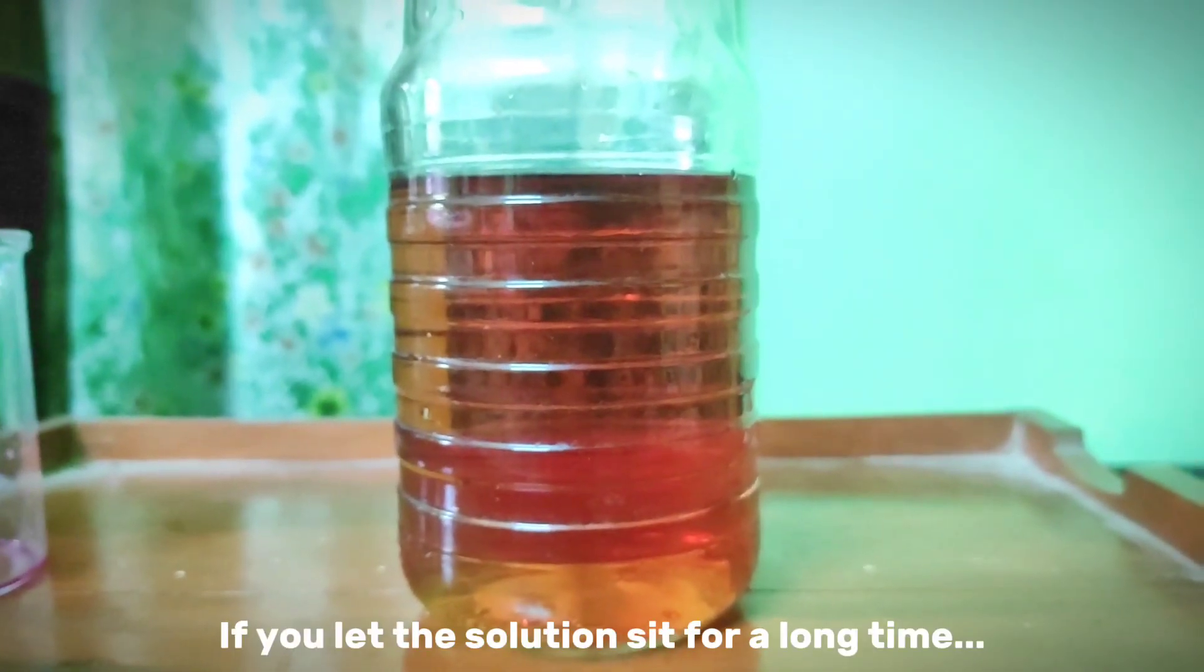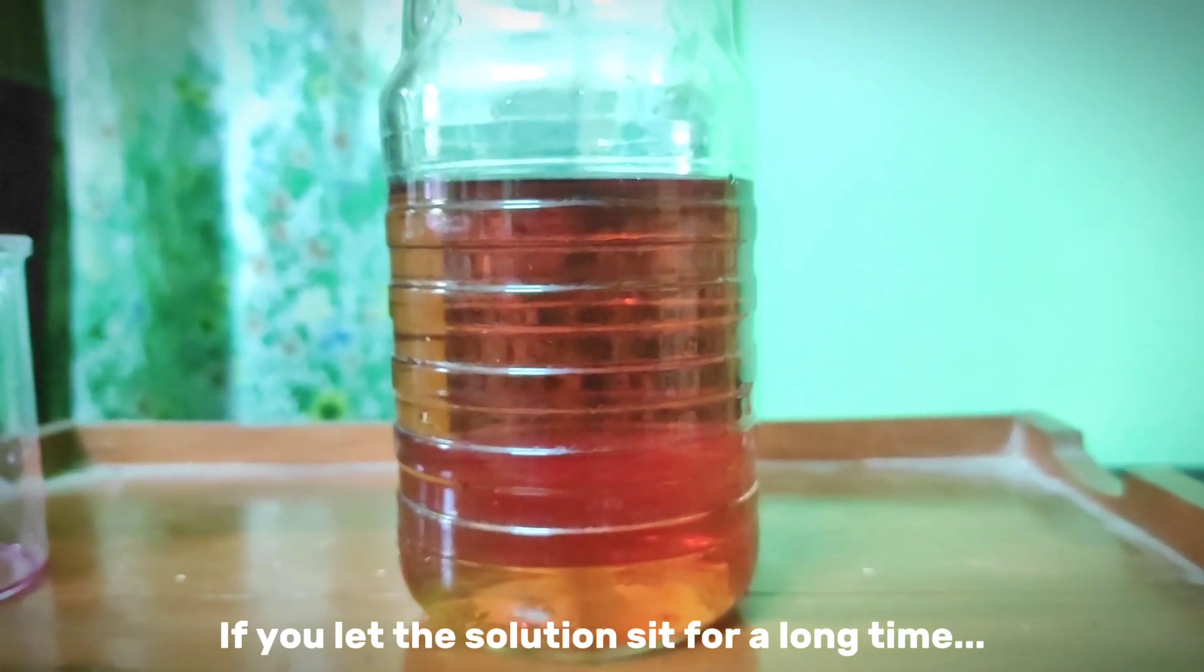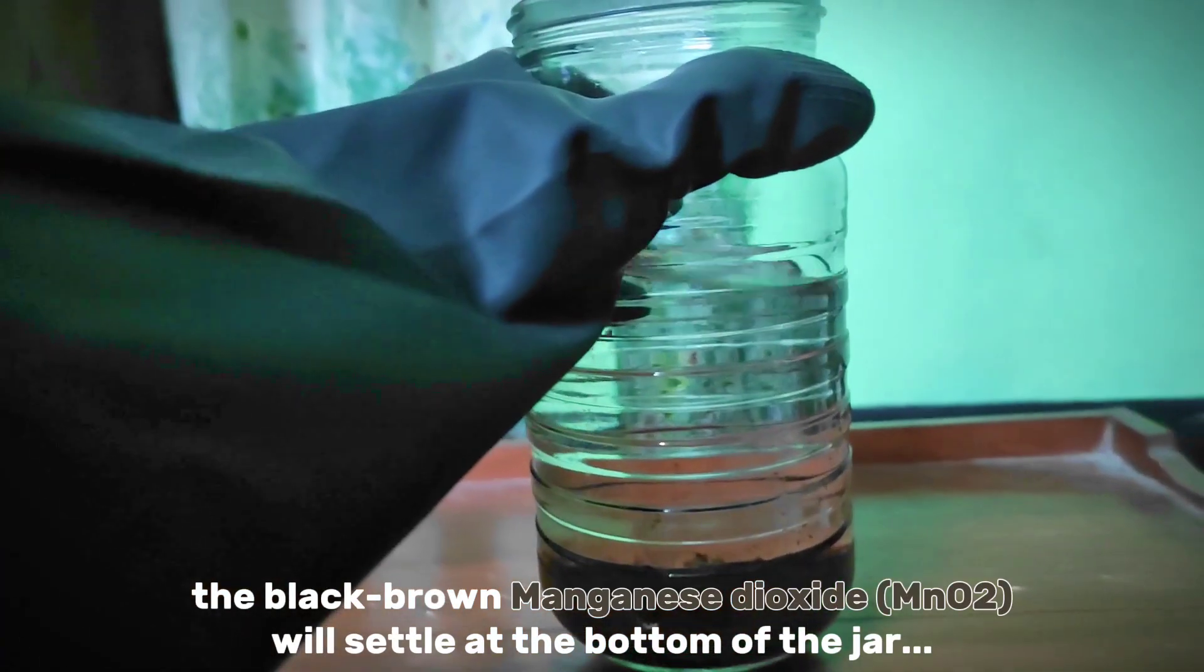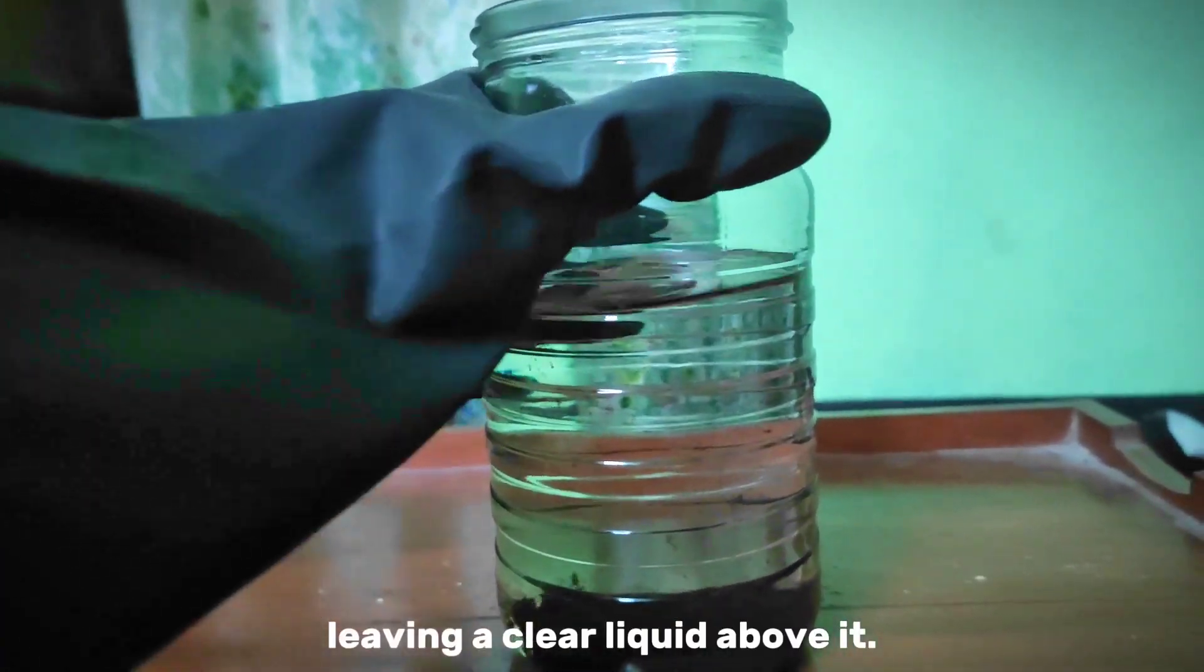If you let the solution sit for a long time, the black brown manganese dioxide will settle at the bottom of the jar, leaving a clear liquid above it.